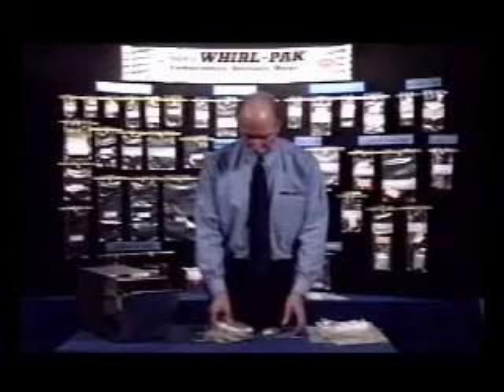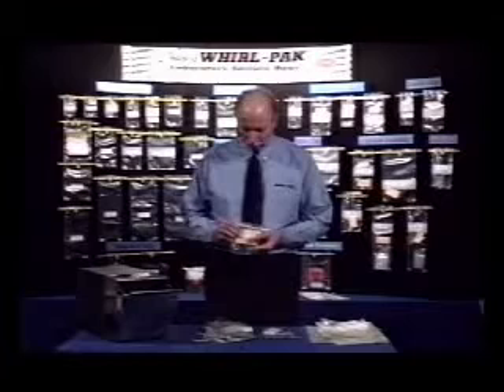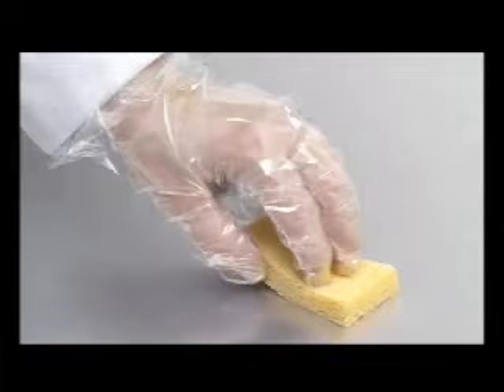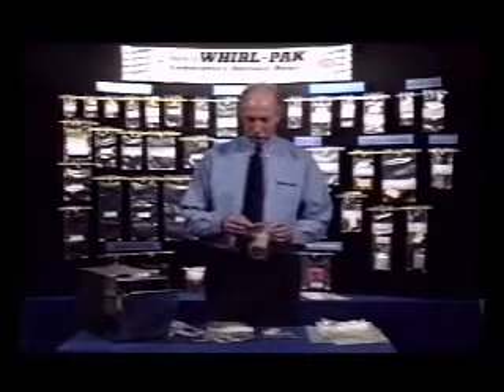The sponge has been tested to be non-inhibitory and will not affect the growth of bacteria. The sponge can be moistened with a diluent such as DE neutralizing broth or other liquid as desired. After the sponge has been moistened, the excess liquid is squeezed out and the surface is wiped with a gloved hand. Then the sponge is returned to the bag and sent to the laboratory for testing.